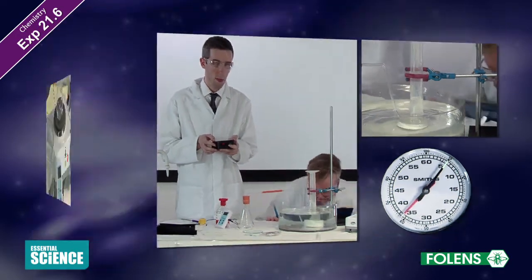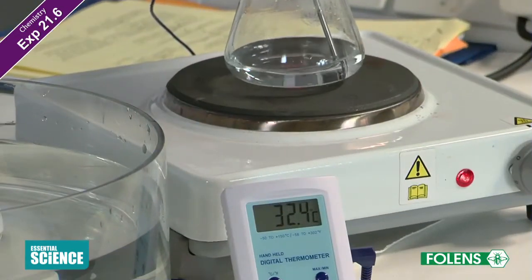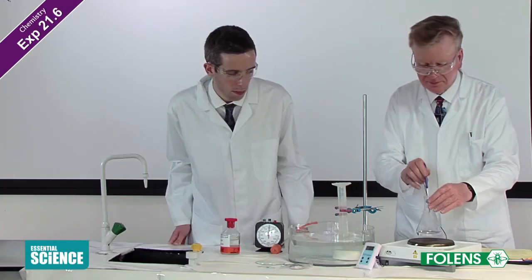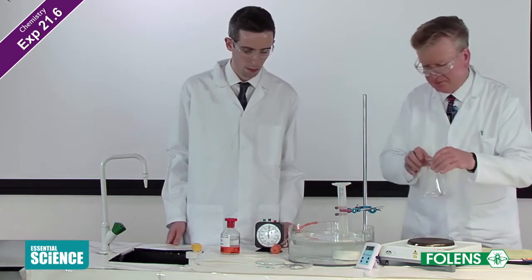flask. Repeat the experiment, but this time warm the hydrochloric acid in the conical flask to about 30 degrees Celsius on a hot plate before adding the magnesium metal.